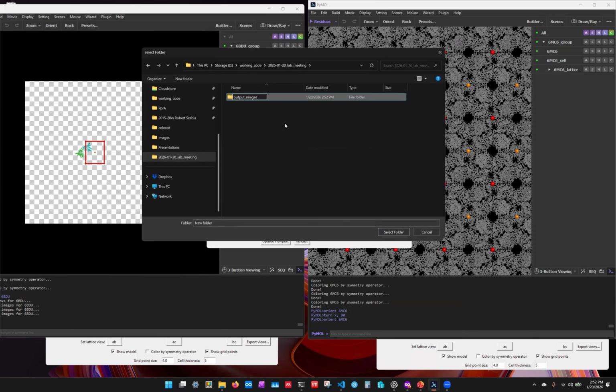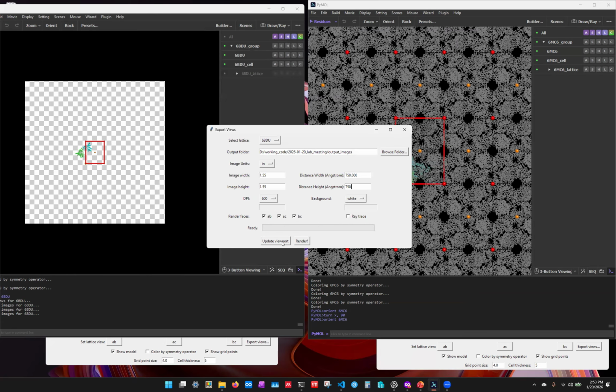Does the GitHub download have instructions? Yeah. How long did this take you to make? I've had some version of this script since the DDRC paper, because I needed it to make figures, but basically last week I just put a GUI onto it. Which is surprisingly easy, actually. The back end of it took a long time, but putting a GUI onto it was pretty easy. So let's render that again.